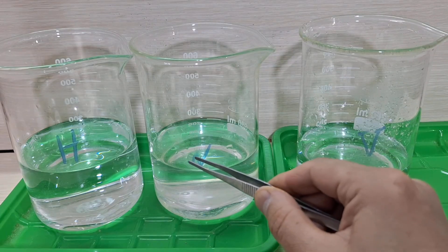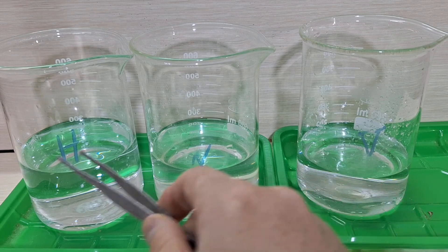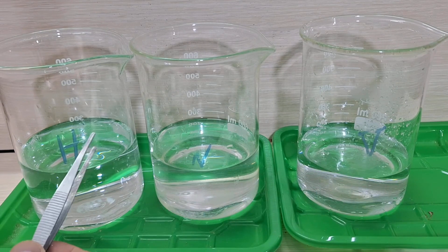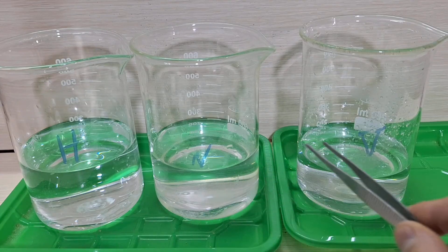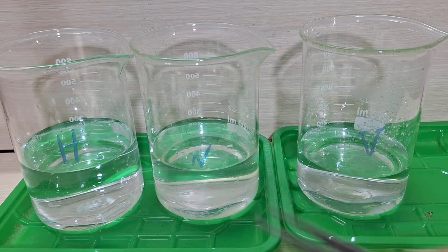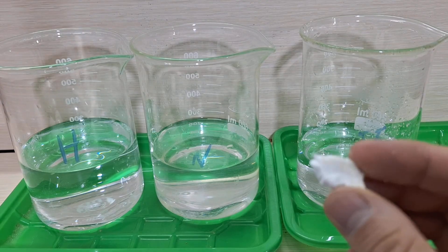To better observe how our acids work, we used three separate beakers filled with nitric acid, hydrochloric acid, and vinegar. Each one was diluted with water to keep the conditions equal. And now, we're adding a raw egg to each beaker.